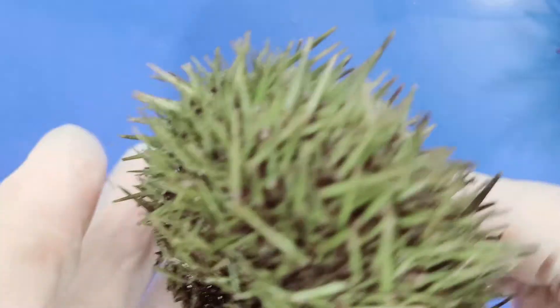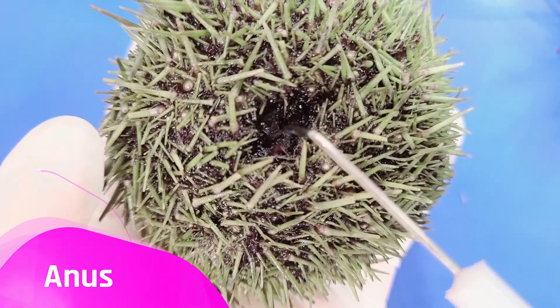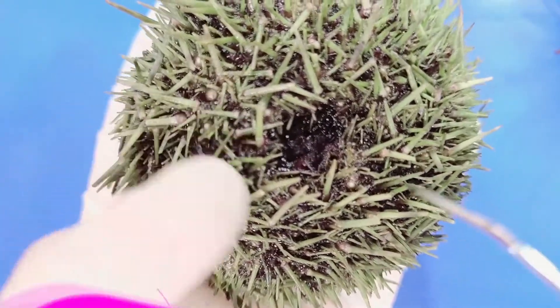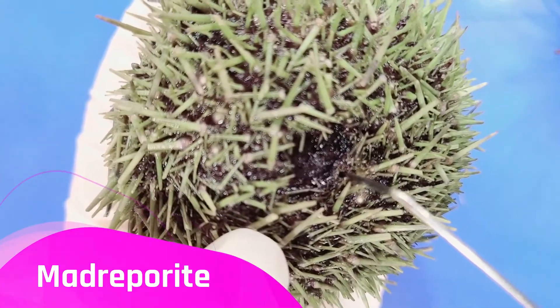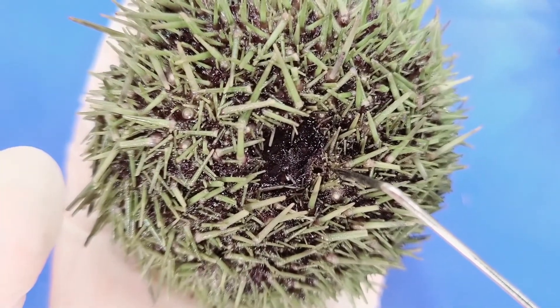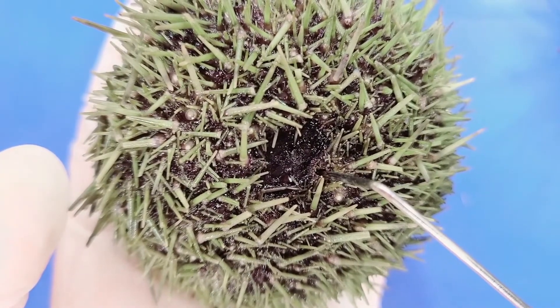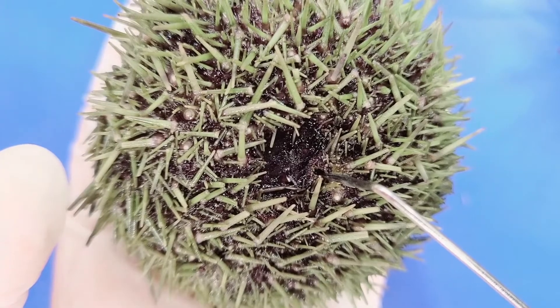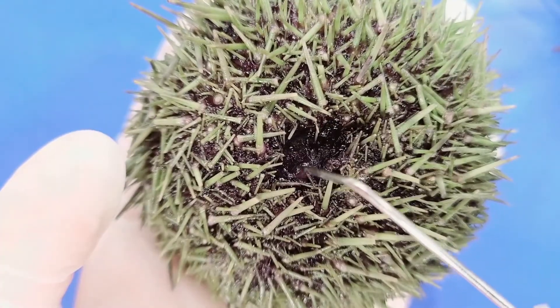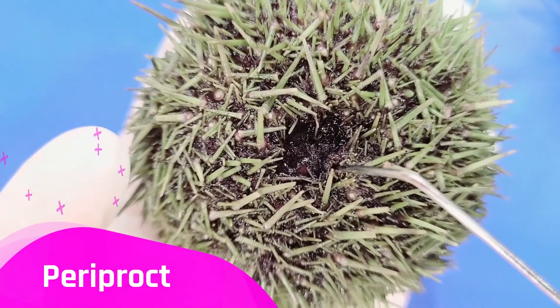On the aboral side, you can see the anus near the center, which is where waste is expelled. Next to that is the madreporite, which is the opening to the water vascular system — the hydraulic system that moves the tube feet. The circular region on the aboral surface that contains the anus and the madreporite is called the periproct.